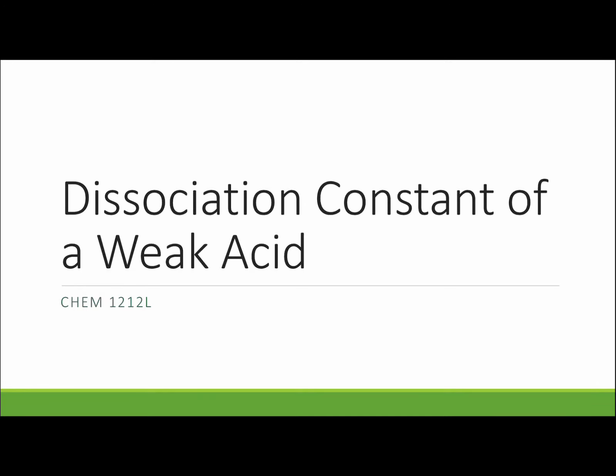Hello. In today's video, I'm going to show you guys how you go about figuring out how to do this week's lab, since this is our first lab that you guys are going to be doing on your own. So we're looking at the dissociation constant of a weak acid.